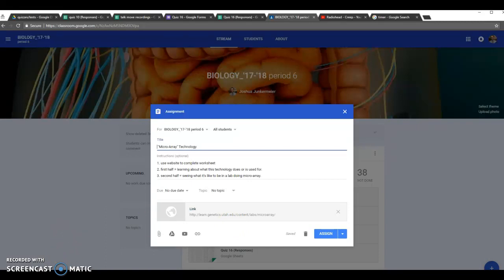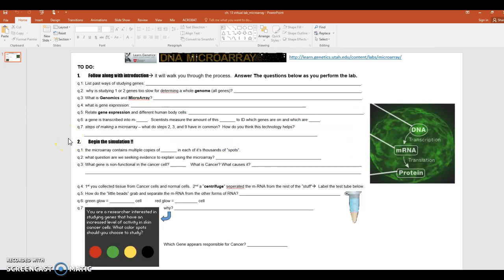All right. So, in general, doing this activity has a purpose. The purpose is to learn more about microarray before we do it in class. So this is preparation. This is a pre-lab activity so that we can be better prepared and better understand the microarray lab when we do it in class together in our teams. So I hope you enjoy it. I hope you find it interesting.